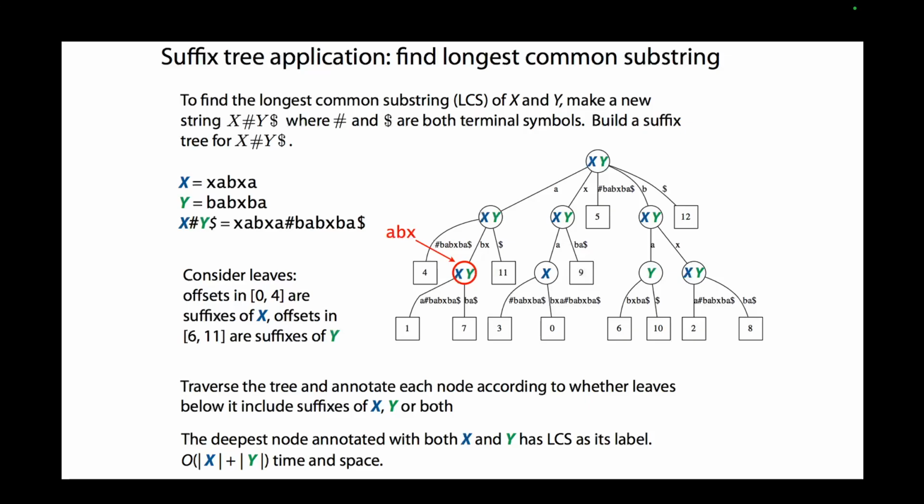So if you are asked to find the longest common substring of these two sequences, ideally the longest common substring between the reference and the read will show you where this read will align to, right? So in alignment, this is where it comes in handy. And the most important thing here is the space and the time. Because it does it in linear space and linear time, this is very useful for us, right?